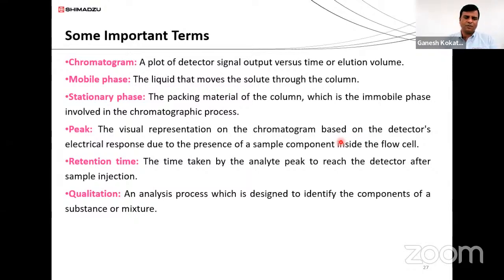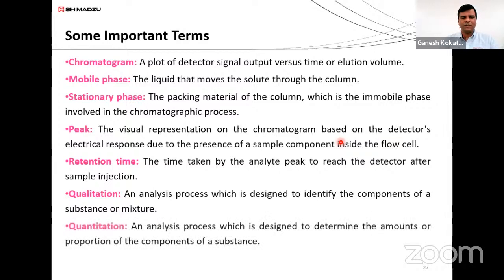There are two purposes: first is qualitative and second is quantification. Qualitative means only identifying a component from the mixture, that is, how many components are there in the mixture. I'm just identifying it. That is called qualitative analysis. But if you want to determine the actual percentage, amount, or proportion of a component with respect to a standard, we call it quantification.